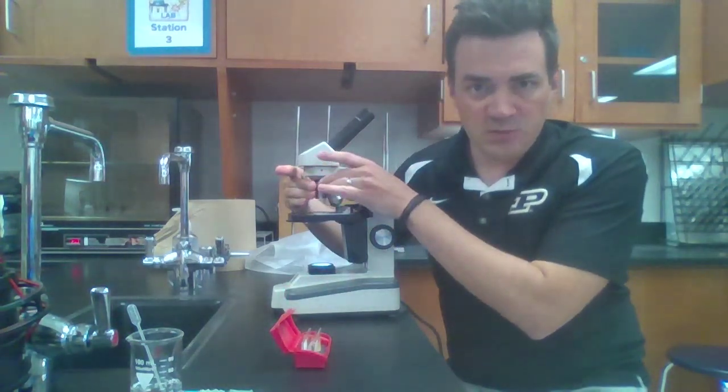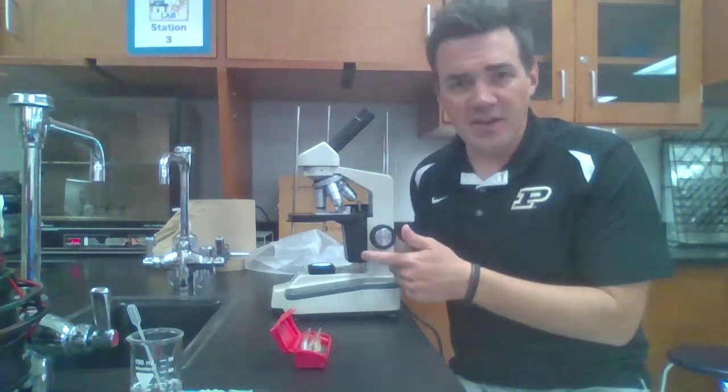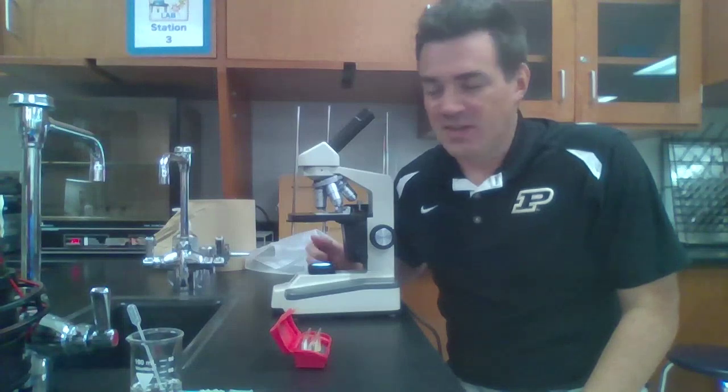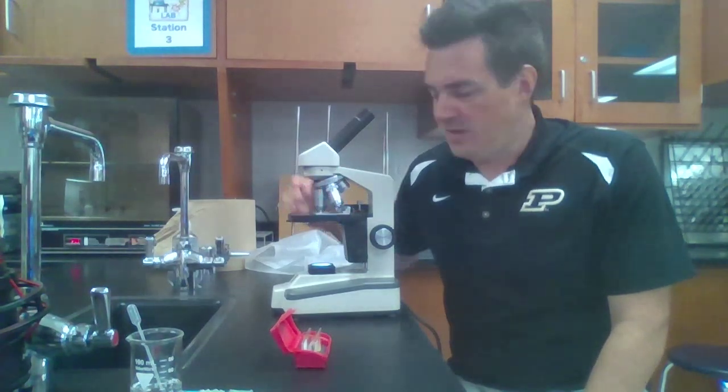To do that, you're just going to switch the objective turret to medium. And now we want to use the fine adjustment to get that back in focus. Often when you change lenses, things are going to be a little bit out of focus, and you'll have to adjust with the fine knob. Same thing for moving up to high power. Once that's in focus, you can go up to high power, and you can use the fine knob to adjust there.